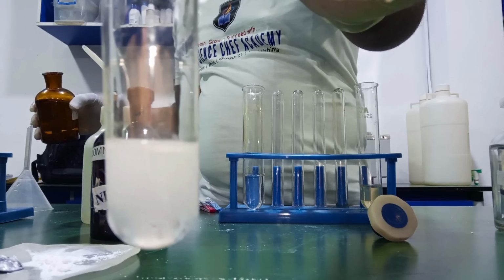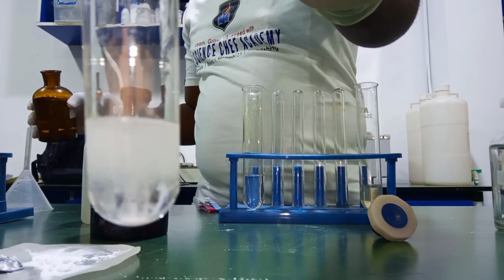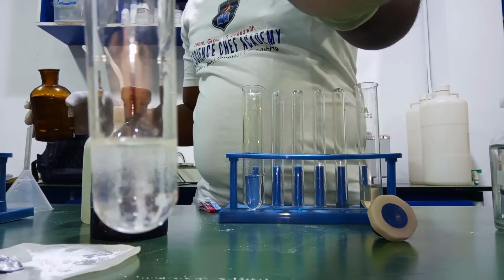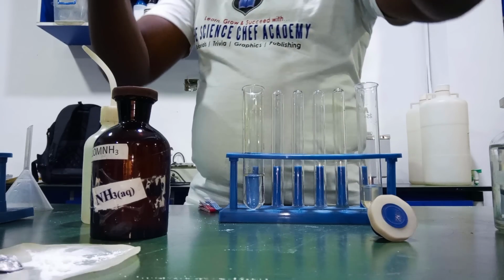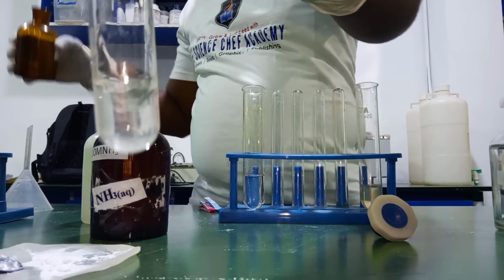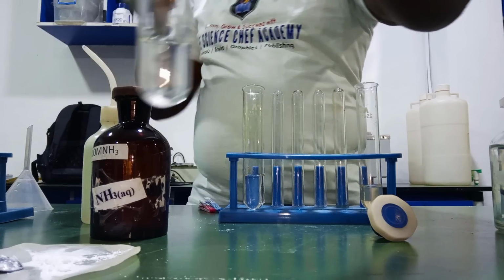Isn't chemistry beautiful? Looks like magic. Yeah, can you see the fizzing from the bottom of the boiling tube? Just like your Andrews liver salt, right? Good. Can you see everything has dissolved completely? Almost. Let's add more to ensure everything dissolves. Okay. Yes, everything has dissolved.